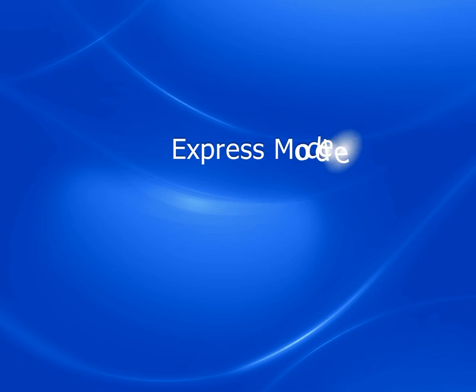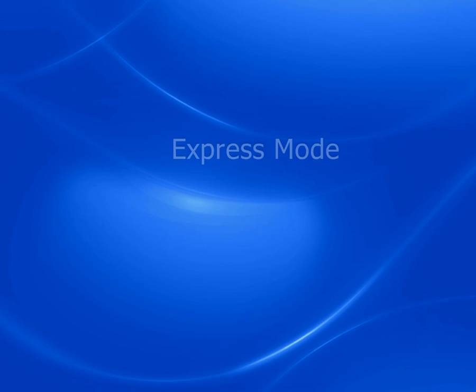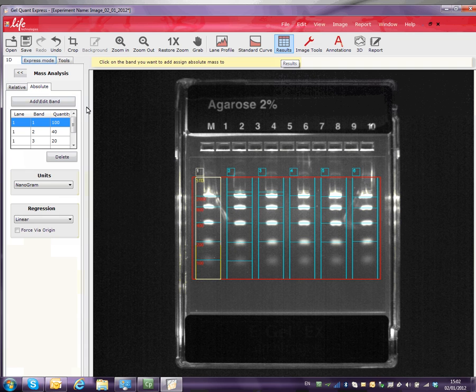In the Express Mode option, flexible analysis tools including easy adjustment to background noise and normalization of bands. Now, click on the Express Mode tab.